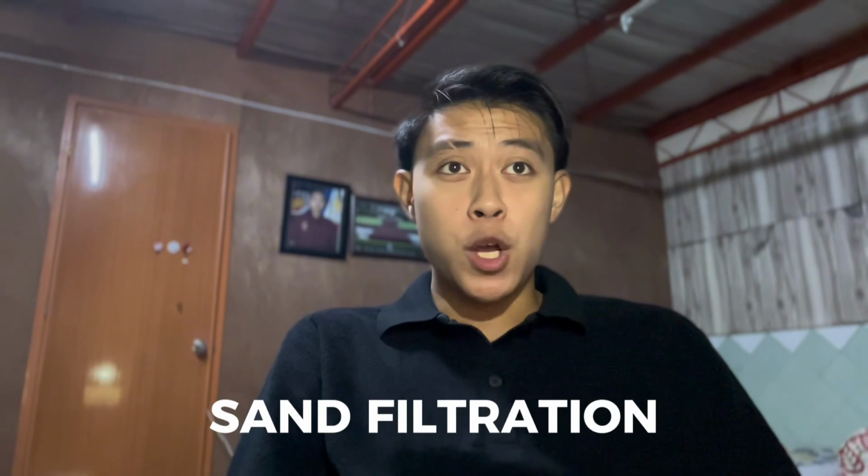So what's our first method of water purification? We'll start with sand filtration, one of the simplest and oldest purification methods. We place filter paper in a funnel, add fine sand followed by coarse sand, and pour dirty water through it. The sand layers trap dirt, debris, and solid particles as water passes through.